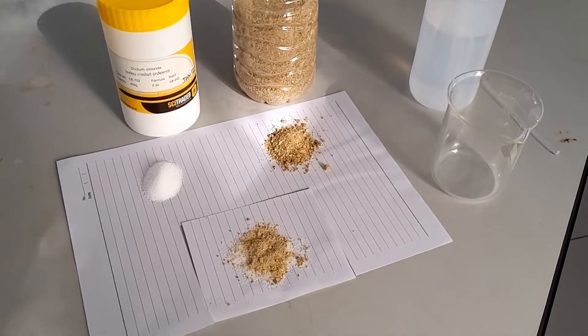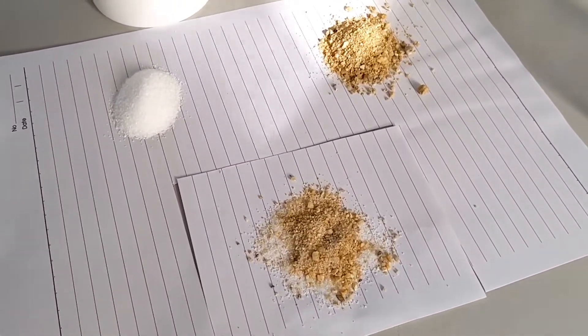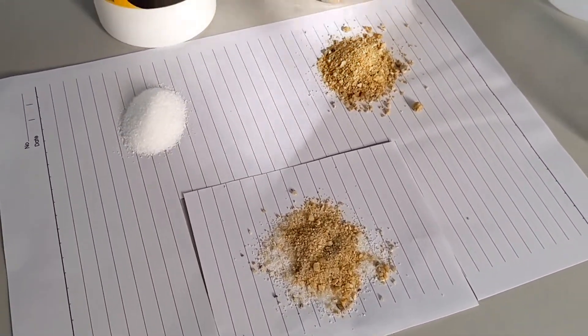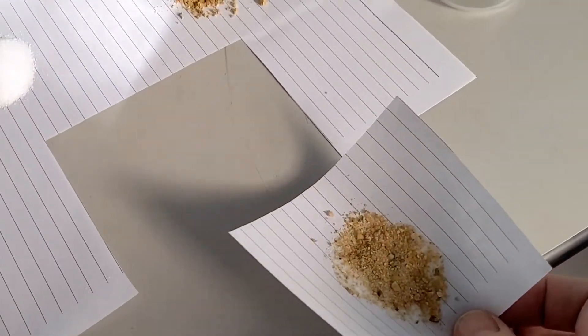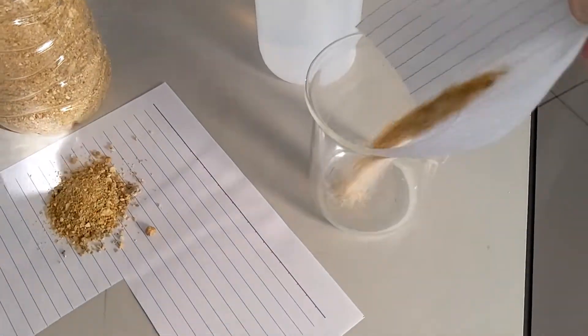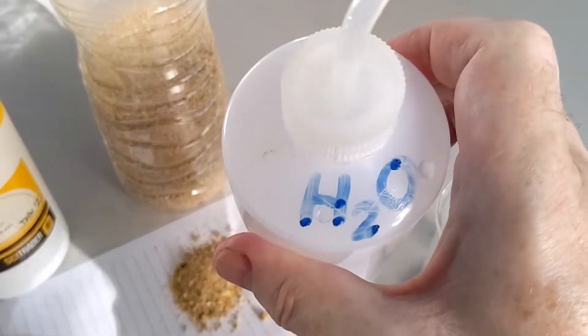Separating a mixture of salt and sand. How do we do it? Well first we take our mixture and we add water, H2O.